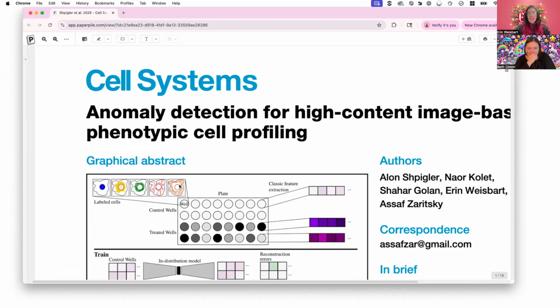So we started with cell painting. This is just a setup of a cell painting plate, as if we're zooming in on the corner, although one should never line up their control wells all in a row. This was just my quick way of illustrating it. Side note, this is not actually how the plates are arranged in real life. Usually, sometimes they are.